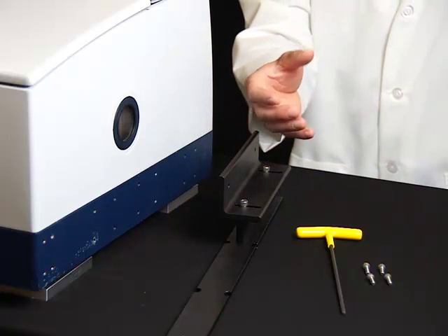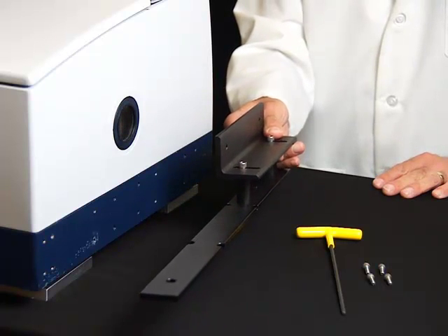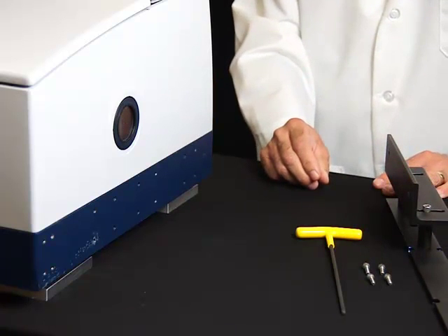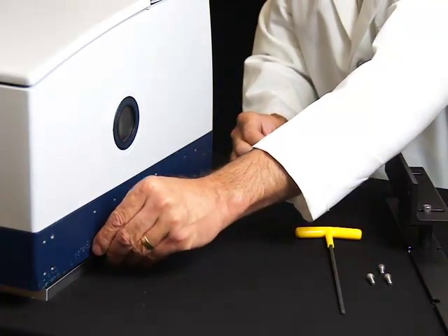The accessory bracket is pre-aligned for your specific spectrometer and should not require any additional adjustments. Attach the bracket to the instrument's base with the screws provided with the assembly. The actual bracket may look slightly different depending on your accessory and system configuration.